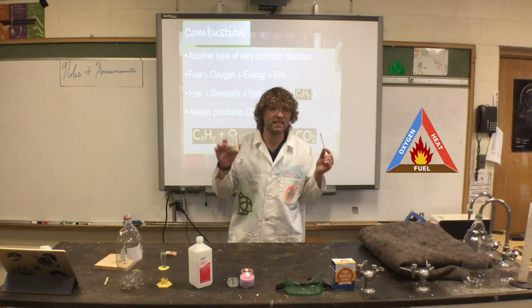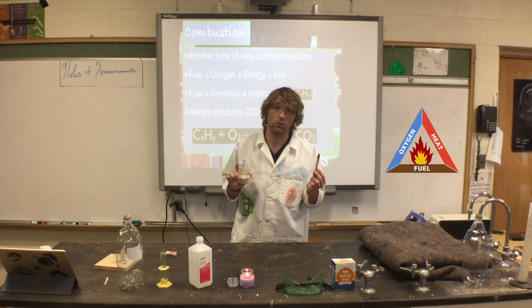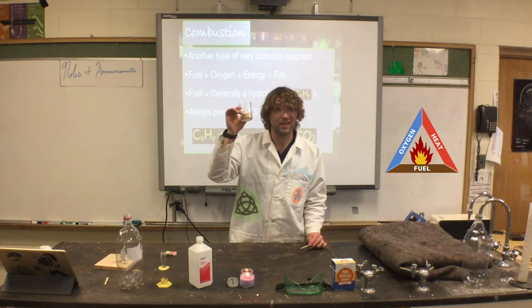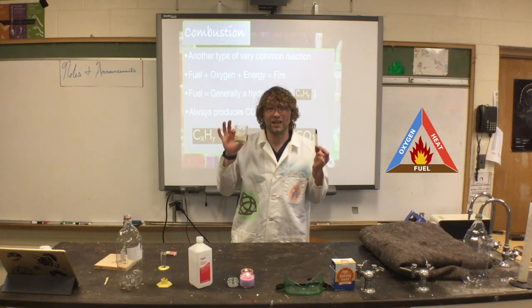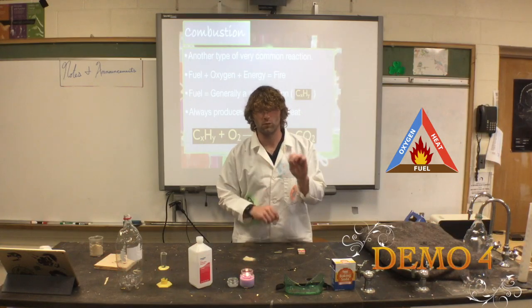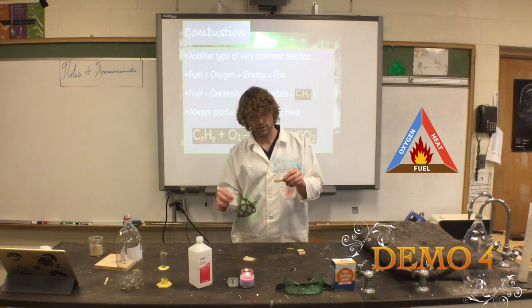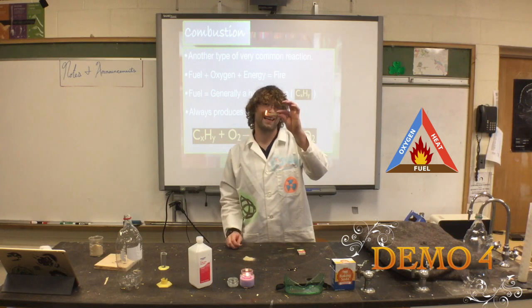I have one substance in two forms right here. I have a piece of wood, just some plywood that I've been making birdhouses with my students with, and then I have the sawdust created from cutting this exact board. So these two substances are chemically identical. However, they are structurally different. We'll start off with a fresh, unburnt piece of wood. Just like that, didn't even need to use an entire match. I've already got a flame on this piece of plyboard.